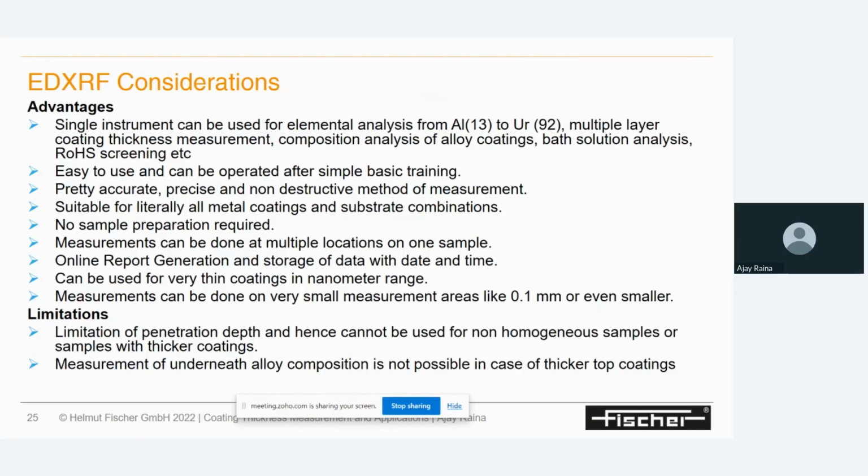The only limitation with XRF is if you are doing very thick coatings. The example I have given you: if you are doing a copper layer of greater than 40 microns, then the X-ray will not penetrate the first layer, and you will not get a composition analysis or the proper signal from the second layer or the base composition.